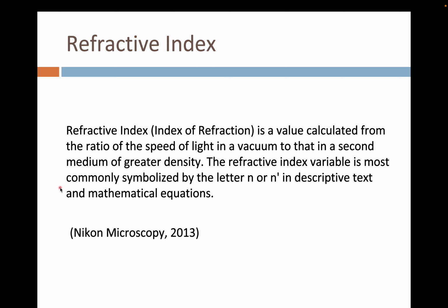Another concept which now relates to increasing resolving power is refractive index. Refractive index, or index of refraction, is a value calculated from the ratio of the speed of light in a vacuum to that in a second medium of greater density.